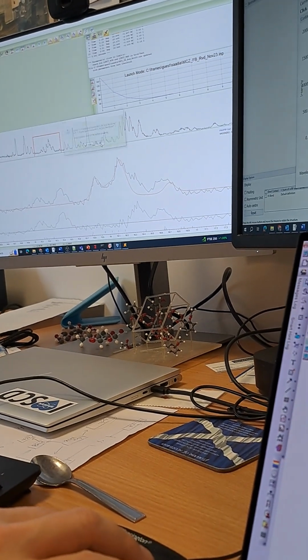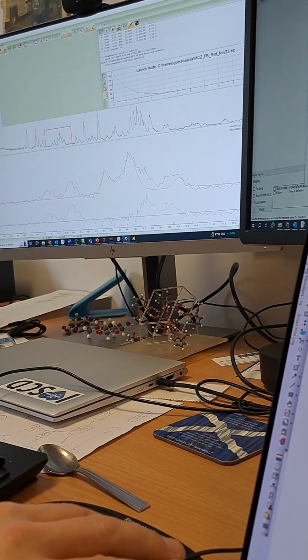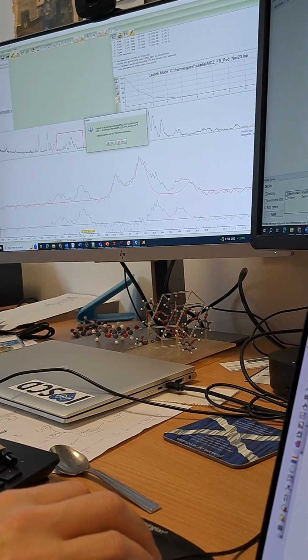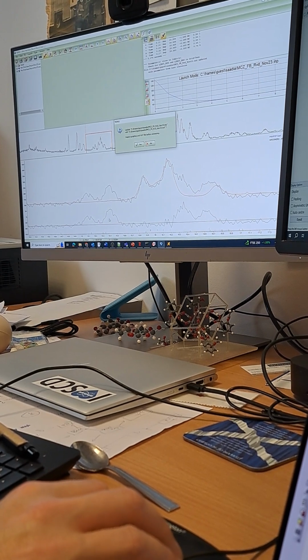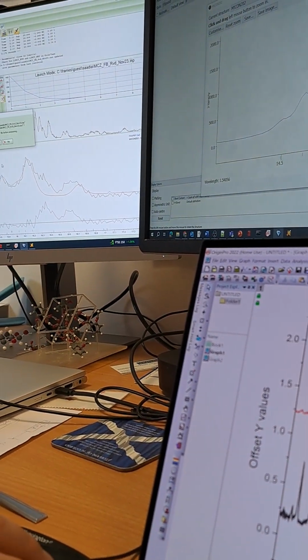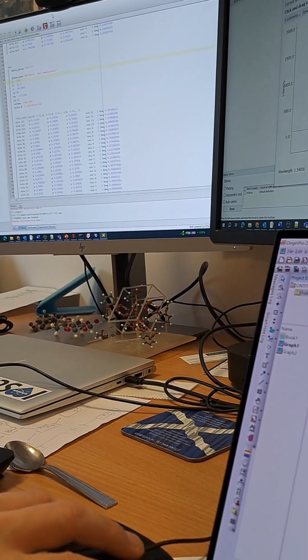Okay, so what do we need to do? Again, 7.8. Okay, so we're now getting into it. We're now pushing out a little bit, pushing up into this peak in here. Right. I think we possibly need a little bit more. Okay, so we'll go 7.7.